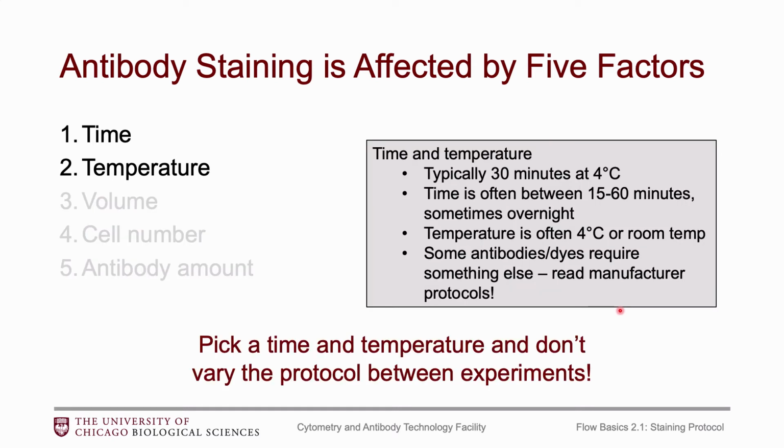For time and temperature, these are pretty easy to keep consistent, so I would say just pick a time and temperature and always use that. I tend to do 30 minutes at 4 degrees Celsius. I've seen between 15 minutes up to an hour. In rare cases, some antibodies might need to be incubated overnight.